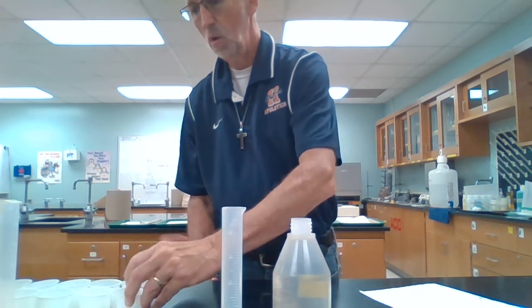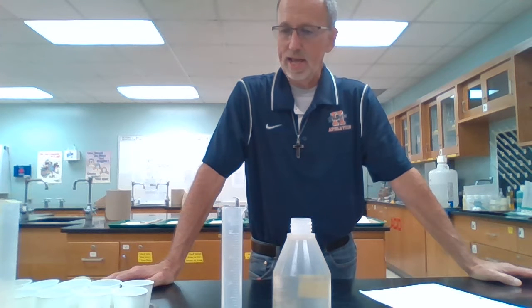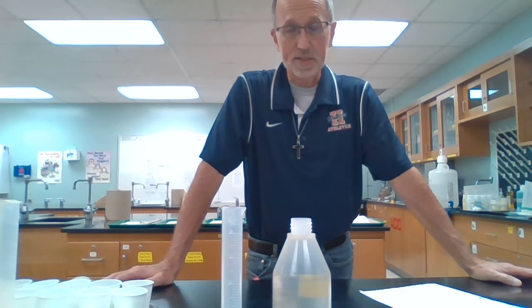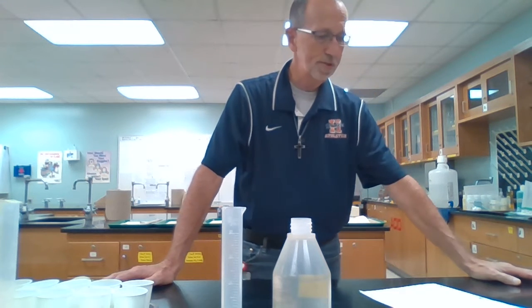With an irregular shape, remember we are not able to measure volume directly with a ruler, and so we would have to find those volumes by water displacement. Of course that'll get the pieces wet. So I think it would be wise if we do all the masses first, and then we'll come back to the volumes. So let's run through the copper first.